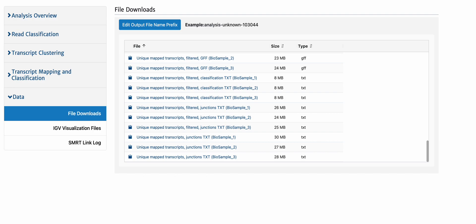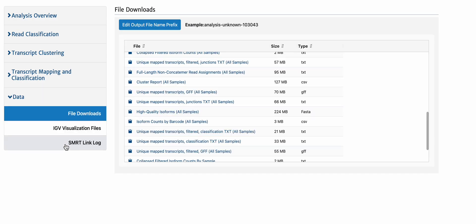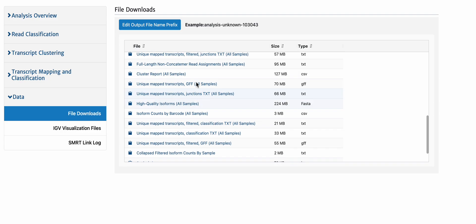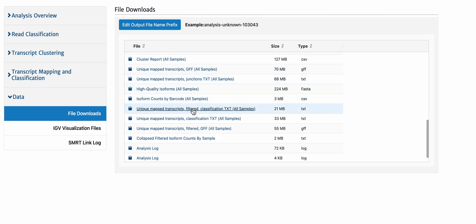If we go back to the data output for the pooled analysis, you'll notice everything says all samples. That means pigeon was only run on a pooled result.